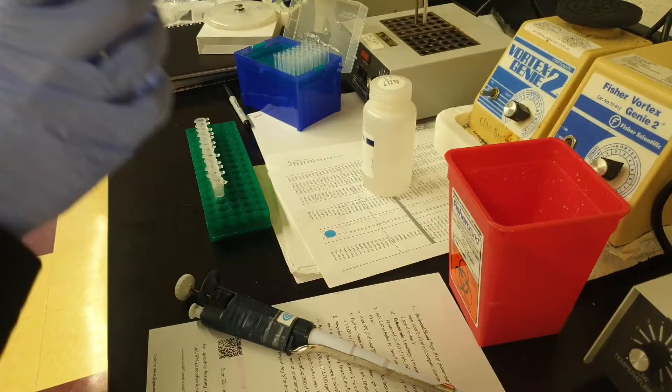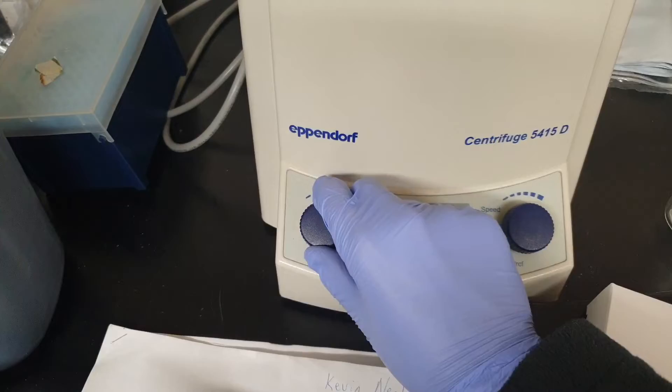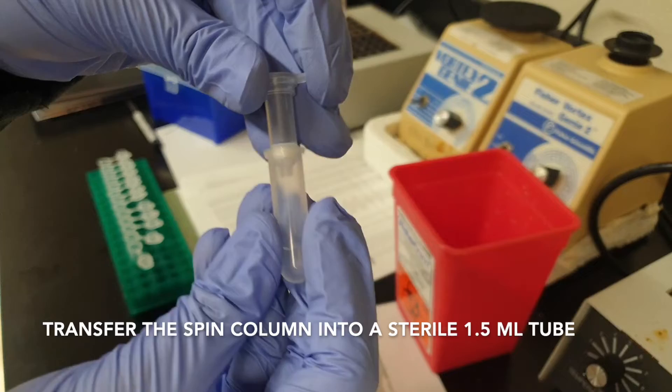Again, 500 microliters. But this time, you're going to do 14,000 rpm for 3 minutes. My centrifuge's maximum setting is 13,200, so instead of doing 3 minutes, I did 4 minutes.